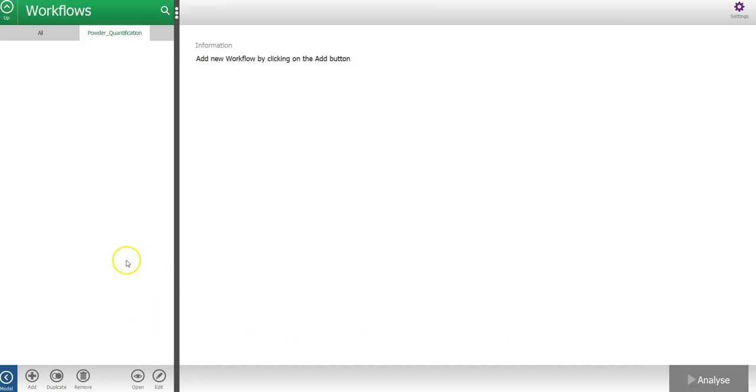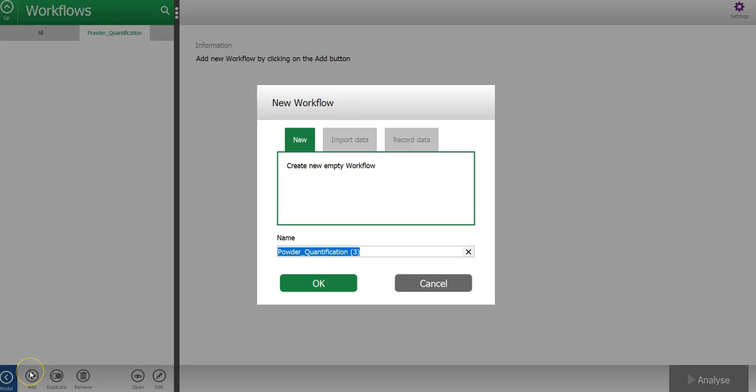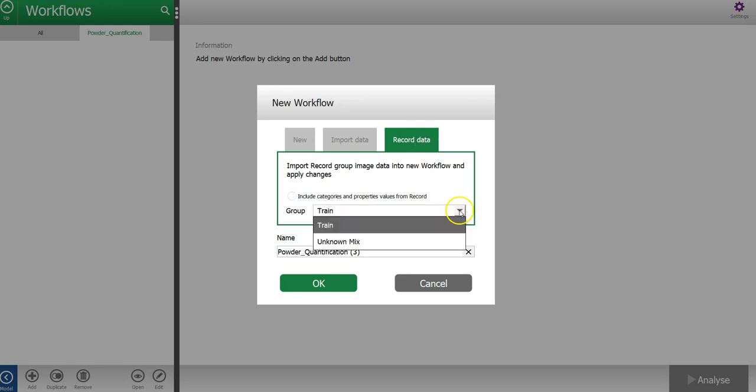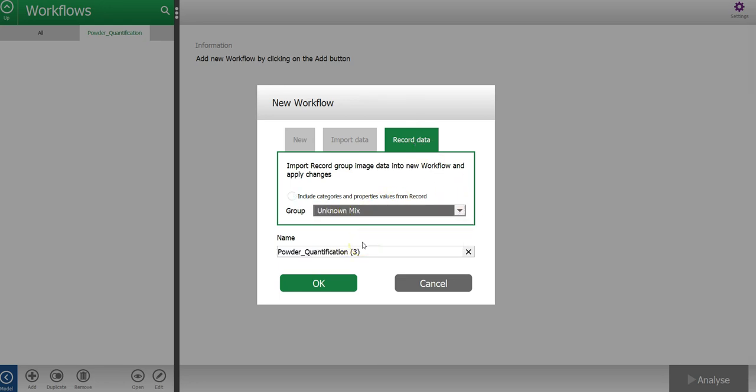And then, once I'm in the play mode, I press the add button to make a new workflow. Here I will select to use recorded data and then select the unknown mix group.